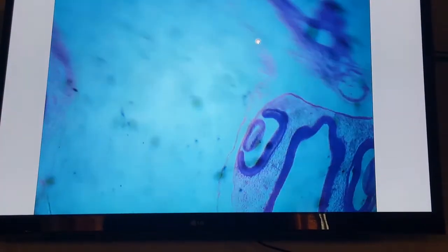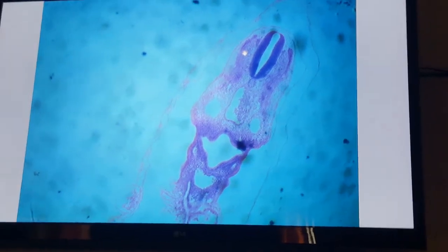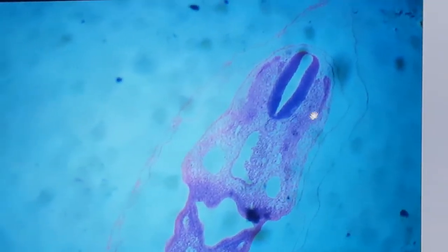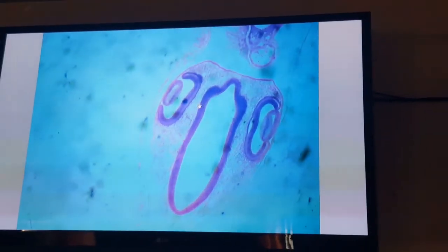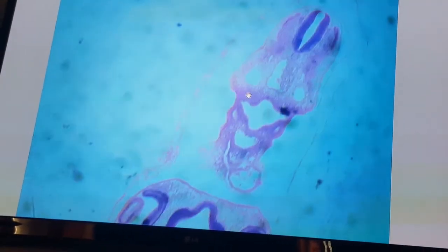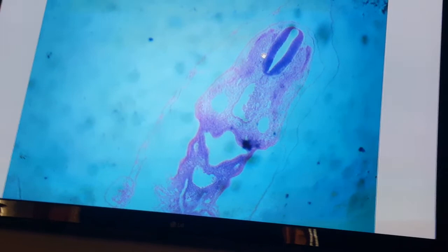Supposing I will consider that part of the section. Here, the dorsal limb shows the spinal cord, and you can see ventral to the spinal cord is the notochord. Look to the dermomyotome and sclerotome. But if I will pass to the other side, to the cranial part, I will see the brain vesicle, and that is the diencephalon. And both the diencephalon and the spinal cord show mantle and marginal zone. But this is an earlier stage for the mantle and marginal zone.